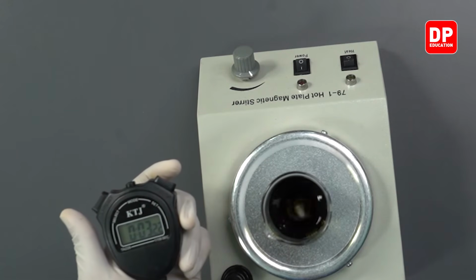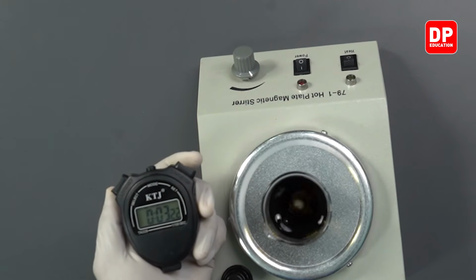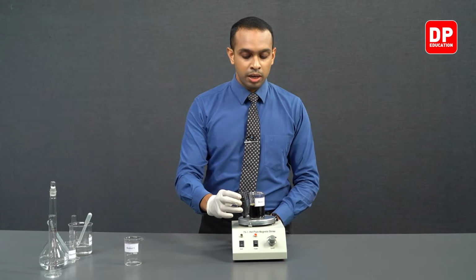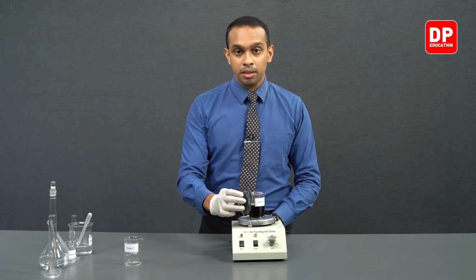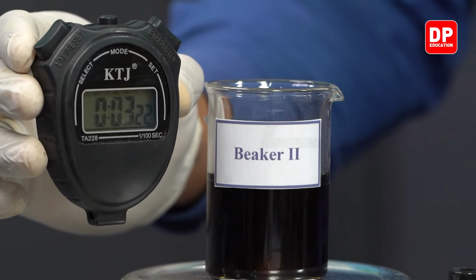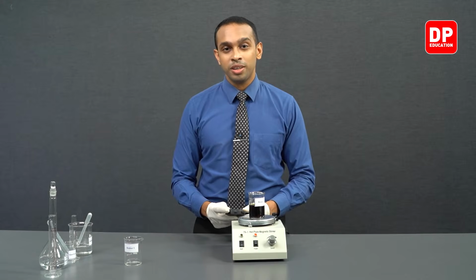The reading comes to 3.22. So the color change was obtained at 3.22 seconds. Now, let's move on to the next part.